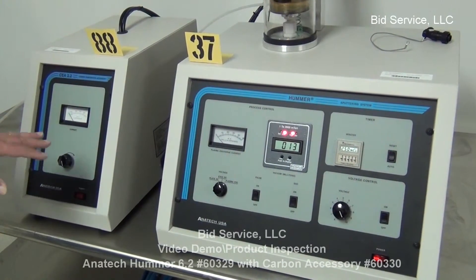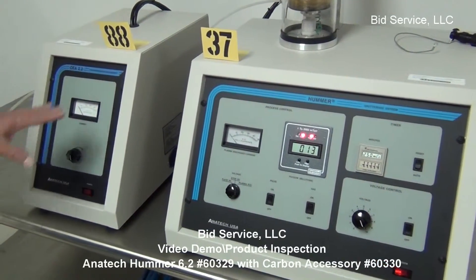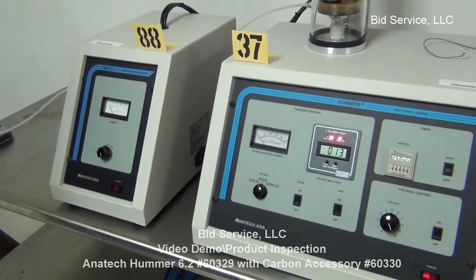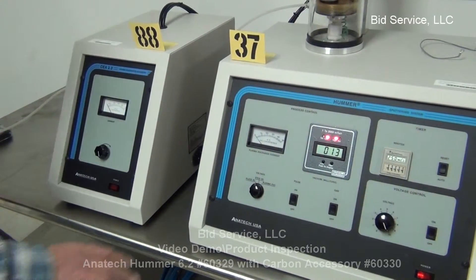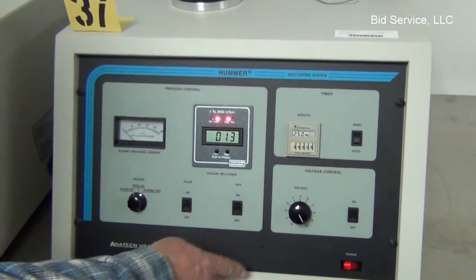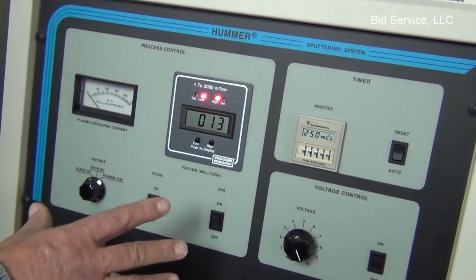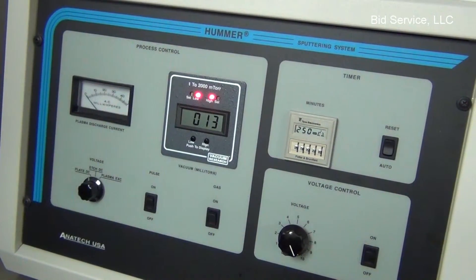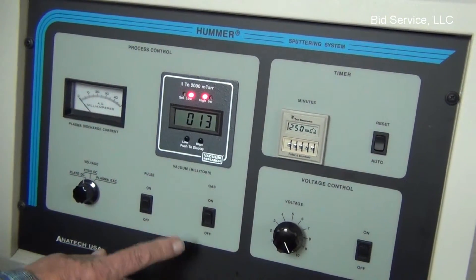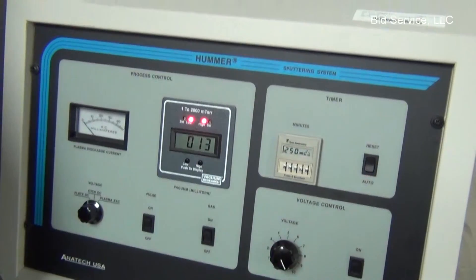I'm going to be demonstrating the Anatec CEA 2.2 carbon deposition, which is connected to the Hummer 6.2. Right now you can see the vacuum level is down to 13 milliTorr. The only thing that you use from the Hummer is power, which is connected in the back, and that's connected to a safety interlock system. And you use the argon gas up here.